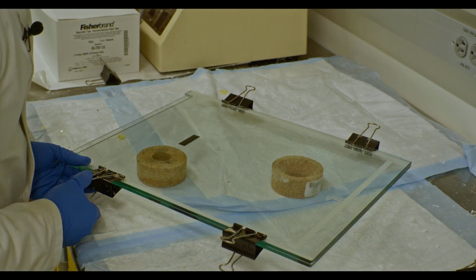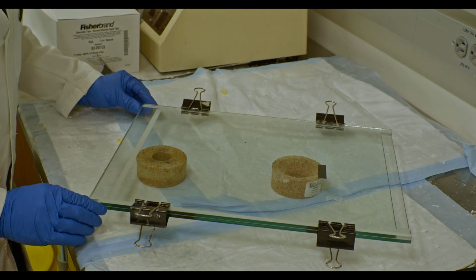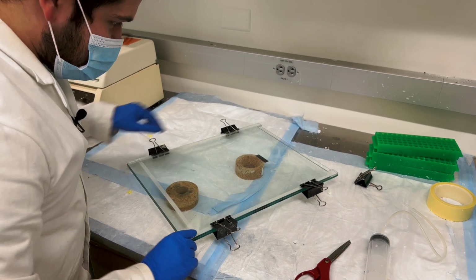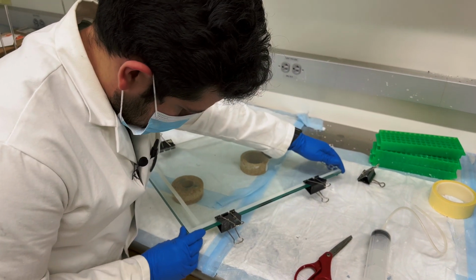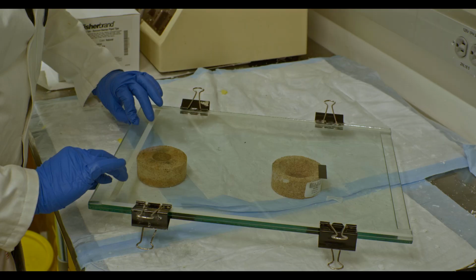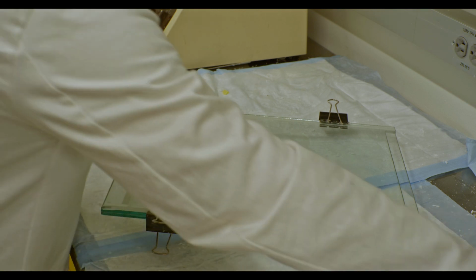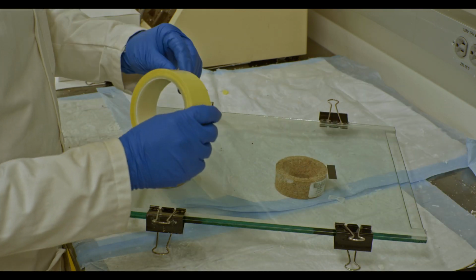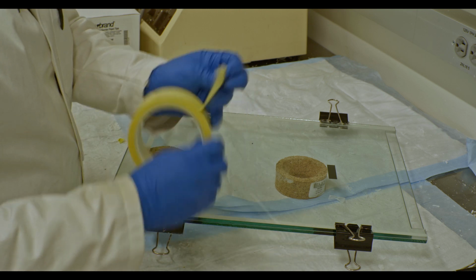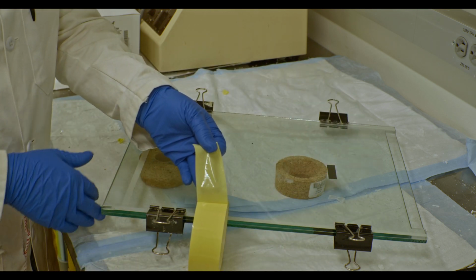Sometimes when you have this gel plate on top that's siliconized, it tends to be a little bit more slippery because of that hydrophobic surface that it has now. But basically, as long as everything is nice and even, you're good to go. The important part is that this bottom edge down here is as even as possible, because the next step is that we're gonna have to tape it. We have to use this gel tape here in order to effectively seal the bottom, because as you can imagine, when you're pouring the gel, if this is open at all, it will pour out.